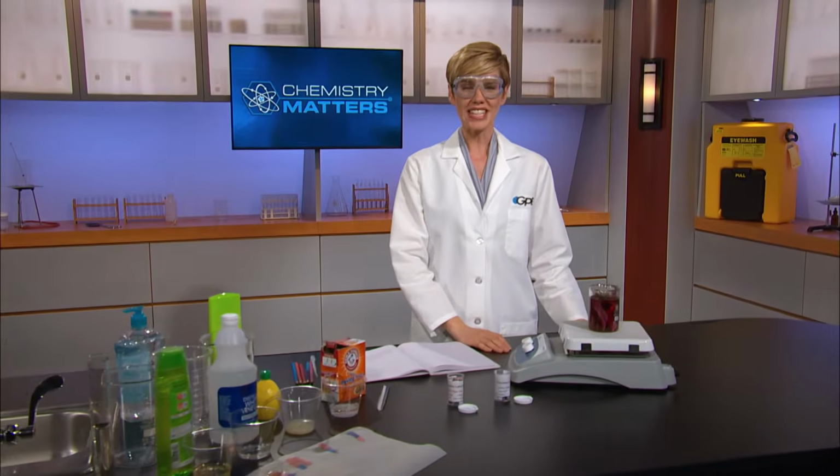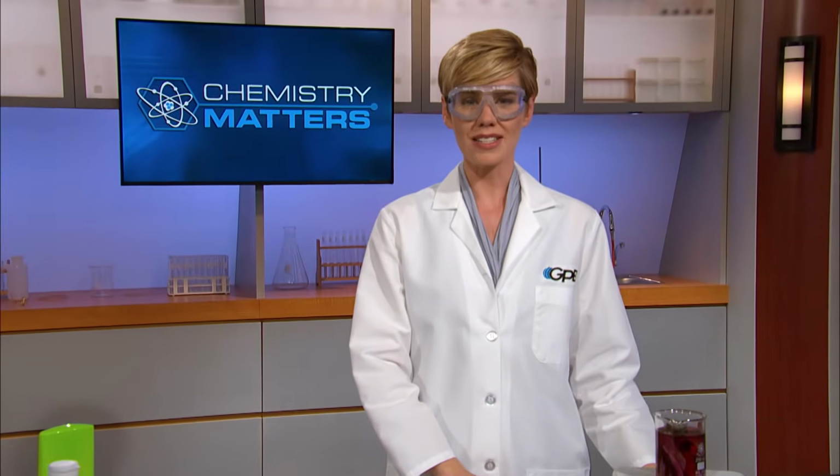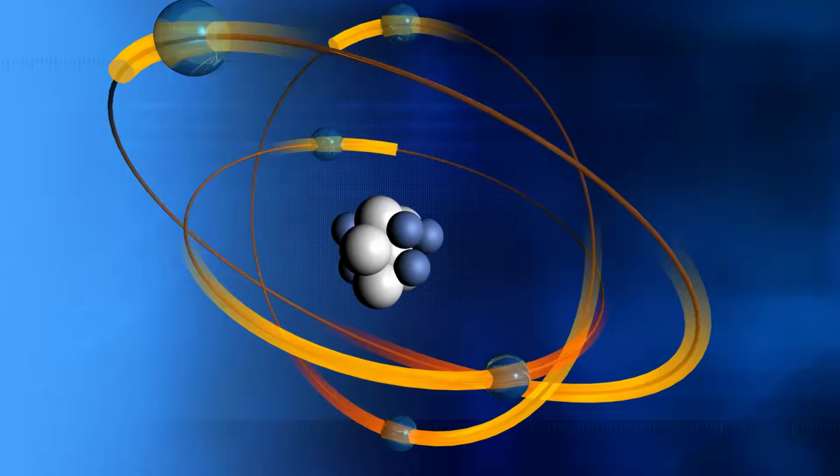Welcome back to Unit 7 of Chemistry Matters, where we're exploring properties of acids and bases. In the last video on our playlist, our students began testing those properties using indicators like litmus paper and cabbage juice. By now, you've been able to conduct similar tests of your own. So let's get back to our classroom to see if your results are similar to the data our students found.